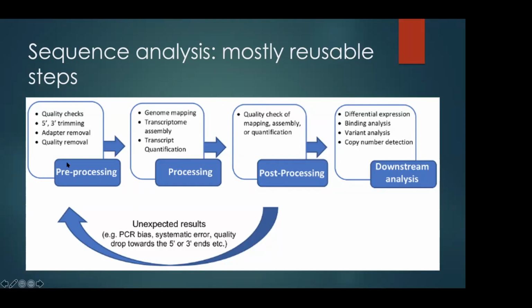So when you look at RNA-seq data, you have these kinds of steps like pre-processing of the data. Usually your data are ready to align, but sometimes when you get your data, what we do first is quality checks. So we're just using a fastqc command to prepare some quality files. And by looking at those files, we can understand if there is something wrong in our reads. If there's something wrong, you can send them back to the sequencing facility to resequence, for example.